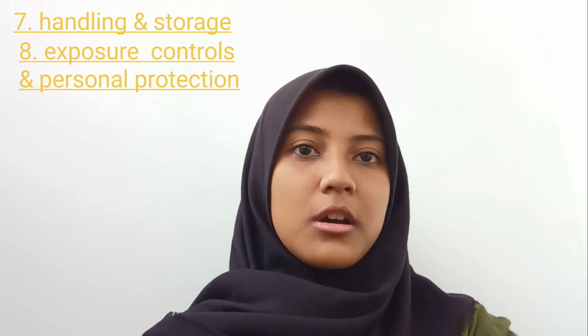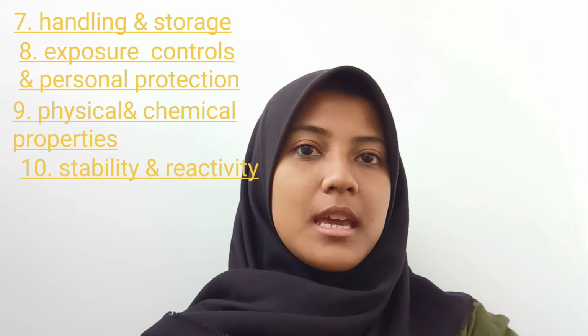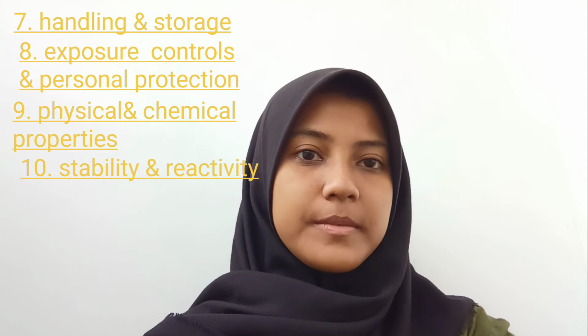7. Handling and storage equipment. 8. Exposure control and personal protection. This describes OSHA's exposure limit and recommendation for PPE. 9. Physical and chemical properties, such as appearance, odors, pH, flash point, solubility, and evaporation rate. 10. Stability and reactivity, how to avoid hazardous reaction.